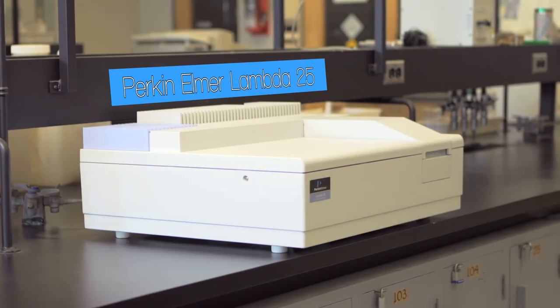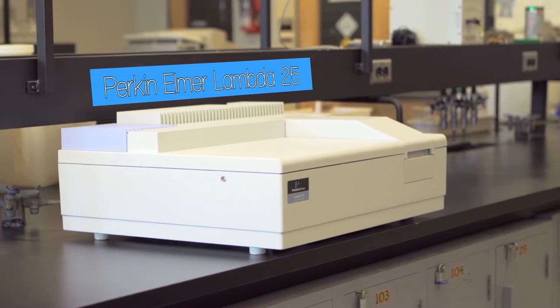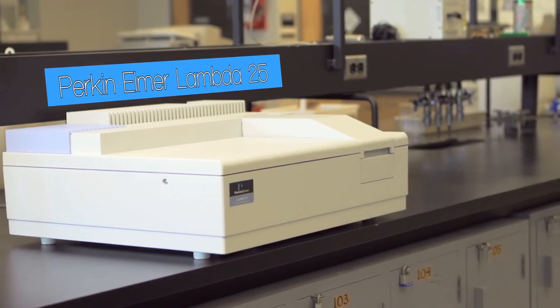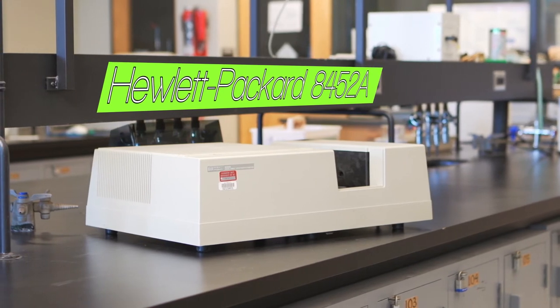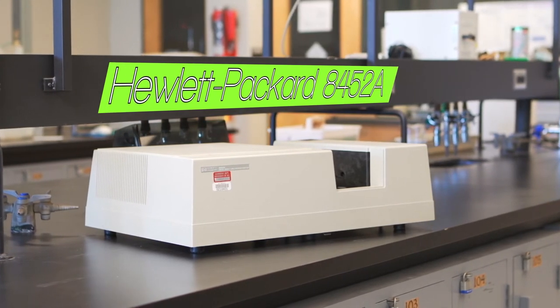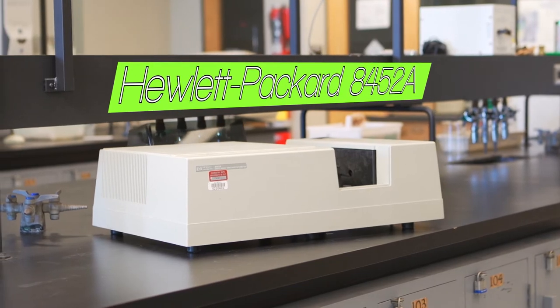We're going to look at two different instruments: the Perkin Elmer Lambda-25 UV-Vis double beam spectrophotometer and the single beam Hewlett-Packard or HP 8452A diode array spectrophotometer.